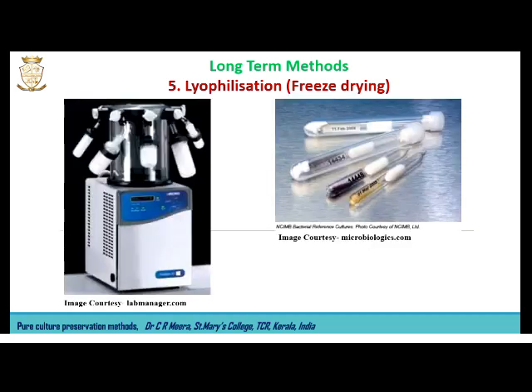In this slide we can see the image of a lyophilizer. Here we can see the ampules connected to the high vacuum of lyophilizer. Second image is of the lyophilized cultures of microorganisms. So here we conclude our topic on pure culture preservation methods.